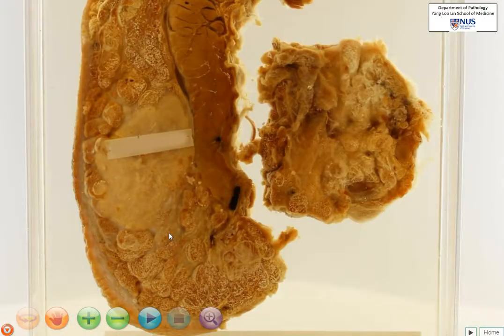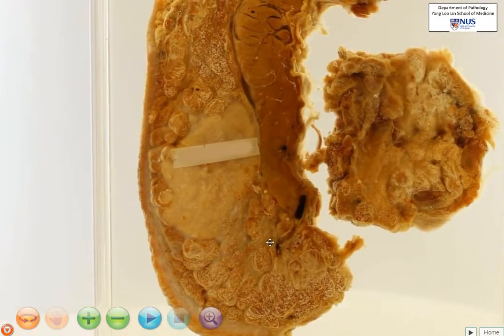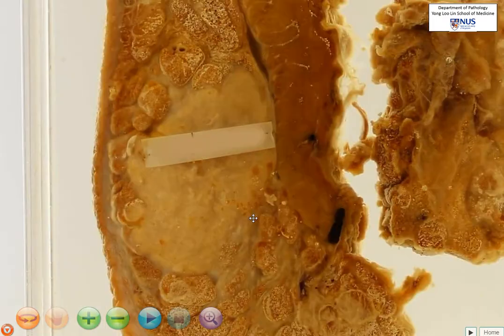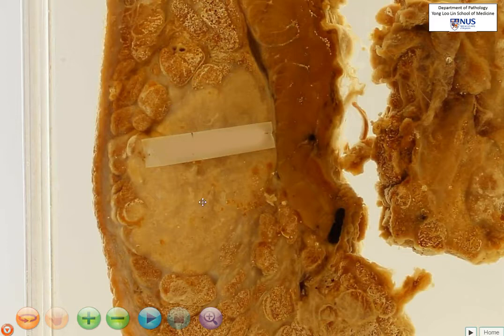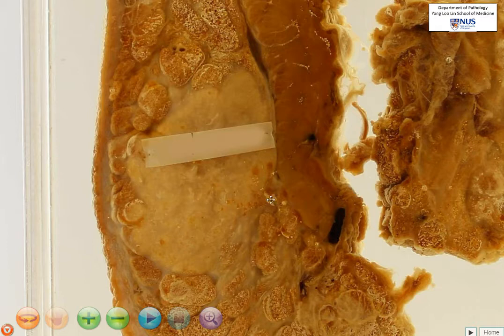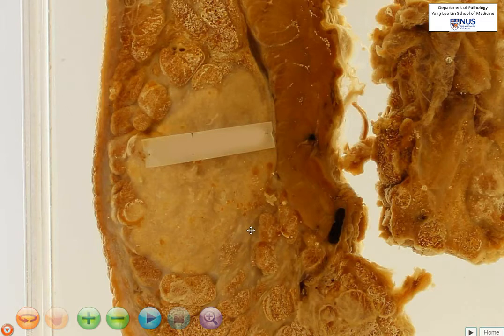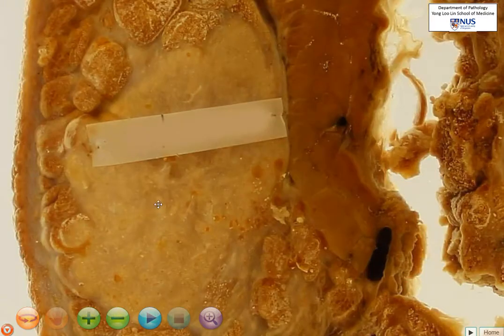So what we are seeing here is an irregular, pale, tan mass. In some areas it appears to be fairly well demarcated, but in other areas you can see that it infiltrates into the breast parenchyma, and I can't really draw a good line between this and the breast parenchyma. This suggests an invasive growth pattern, and it is very fleshy in appearance. You are able to see a few paler, geographic, irregular areas, and these are likely to represent necrosis.